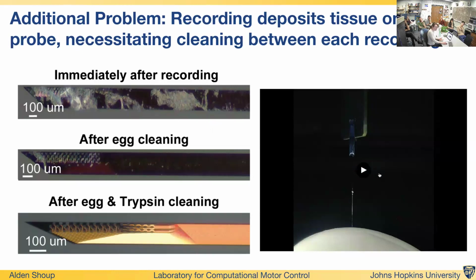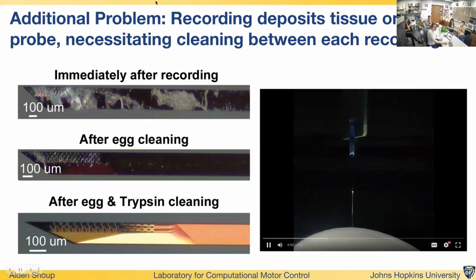So I took a video of our egg cleaning process because I get questions on it all the time. What are you actually doing? Are you actually sticking a probe into a hard-boiled egg? And the answer is yes, and this is how we do it.